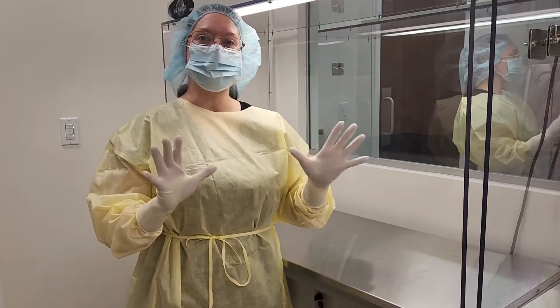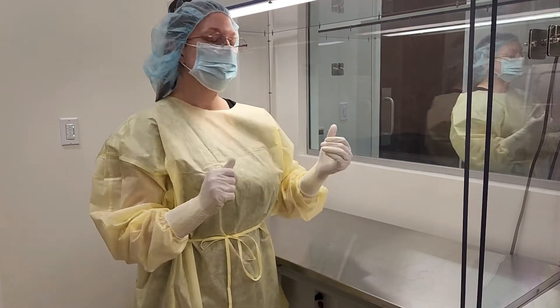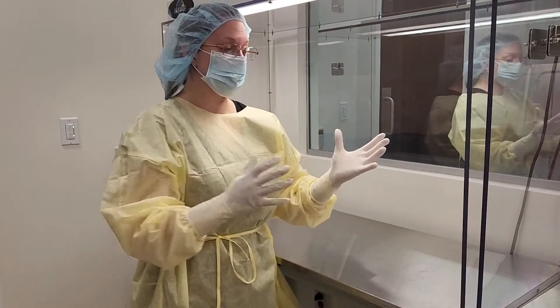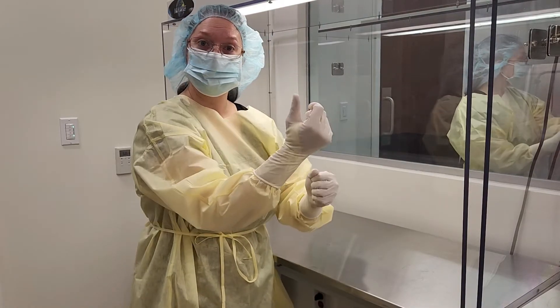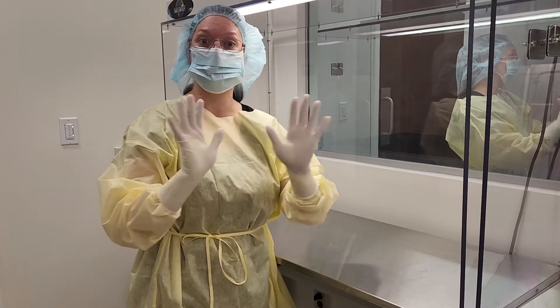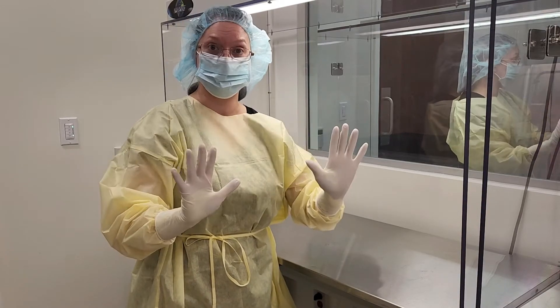Today we are doing glove fingertip sampling. Now you know how to don and garb. What I just did was I just put on my gloves. I did not put anything on the gloves — no alcohol, no isopropyl alcohol, no hand sanitizer.